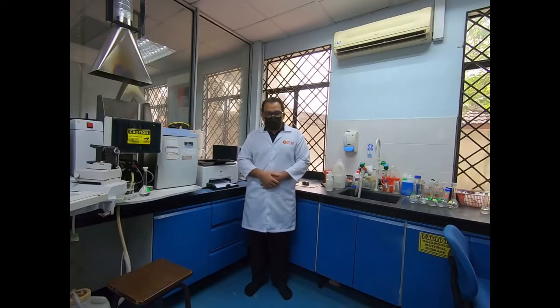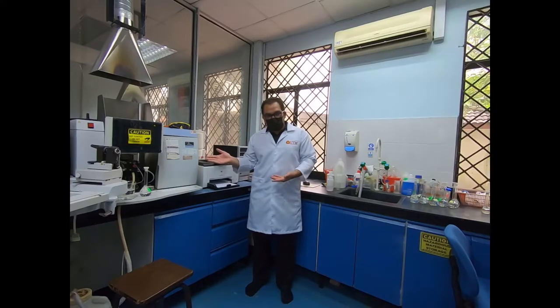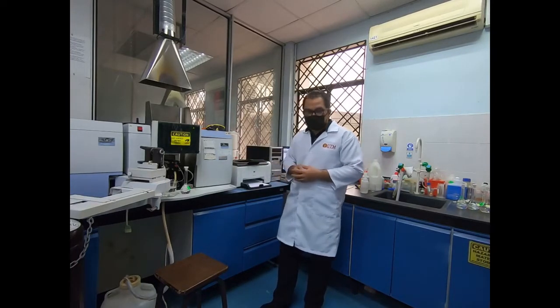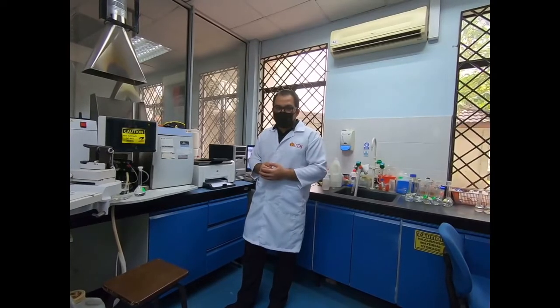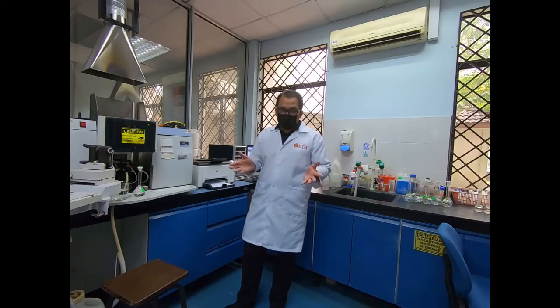Now, I am going to explain to you about our experiment number 3, which is determination of zinc by linear calibration and standard addition methods using atomic absorption spectroscopy. The machine beside me. Atomic absorption spectroscopy is a technique for determining the concentration of a metal element or mineral in a sample. The technique can be used to analyze the concentration of over 70 different metals in a solution. It uses absorption or emission spectrometry to assess the concentration of analytes in samples.